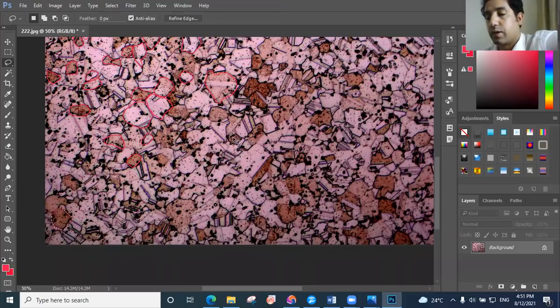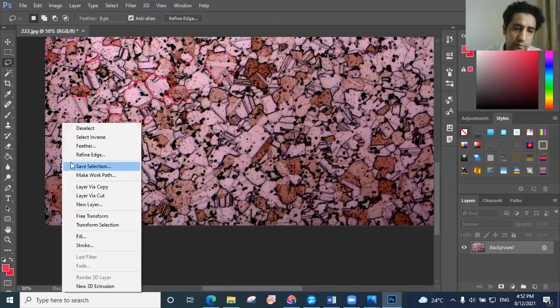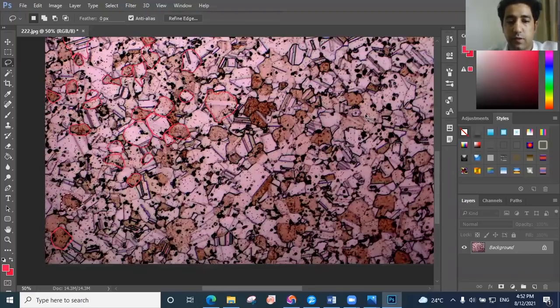So we just cover here with the light. I'm gonna close the light because I want to see the pictures clearly.